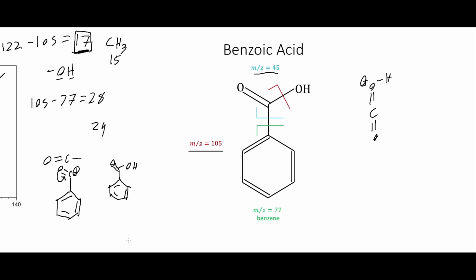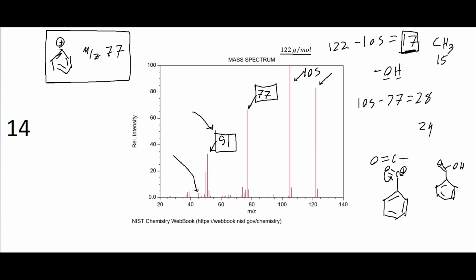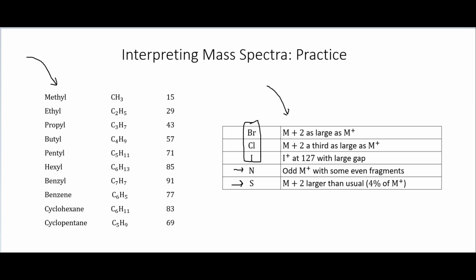But anyway, that was everything I wanted to talk about in this video, just going through a few problems of these mass spectra and how to interpret them.